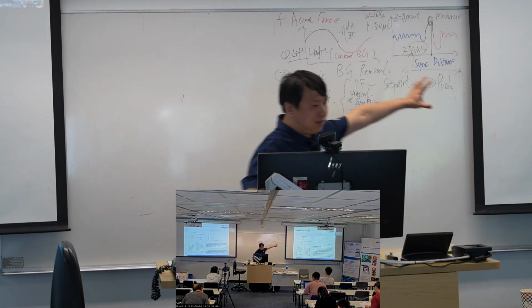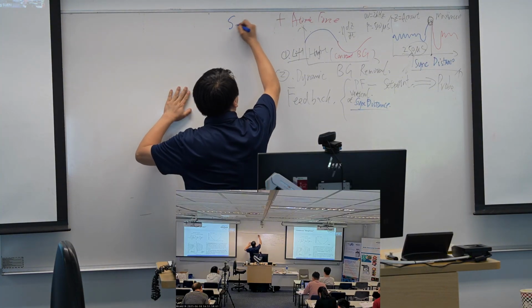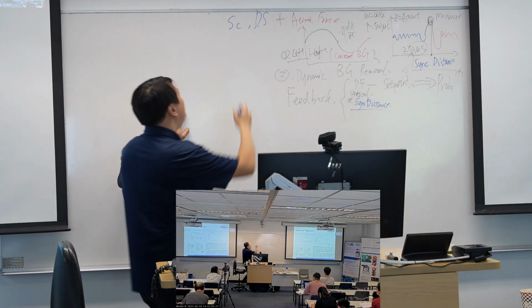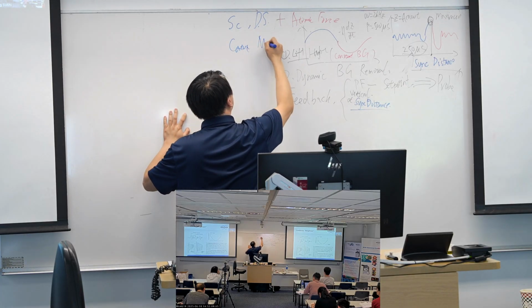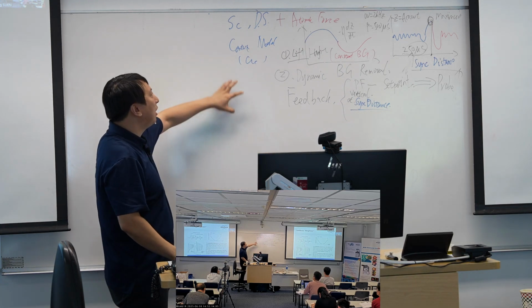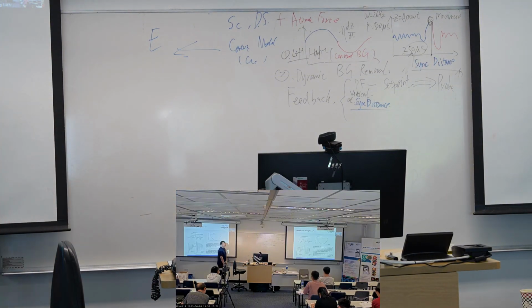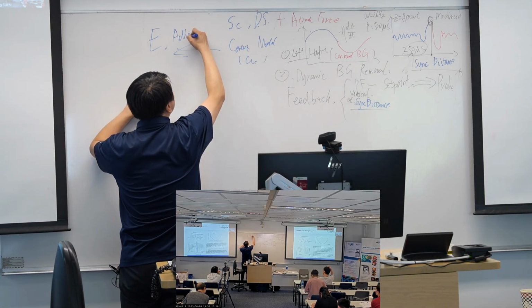Once we get this done, we combine the force curve stuff. We calibrate spring constant, we calibrate the deflection sensitivity, and we define our contact model to define the contact area, contact radius, and then we can get the modulus at each data point. And of course, if you want, it can give you the adhesion force.